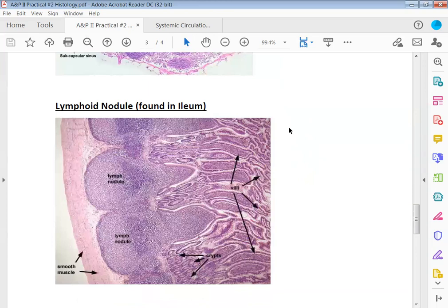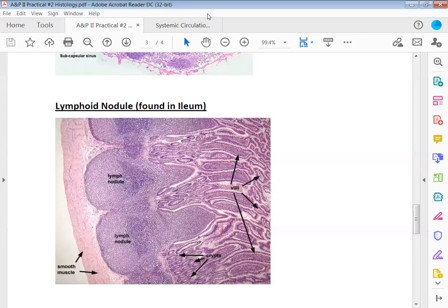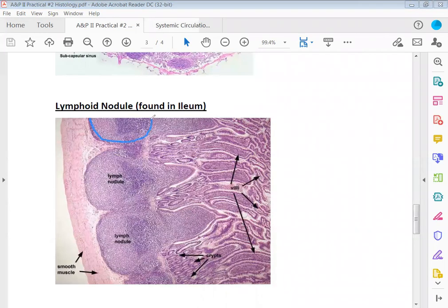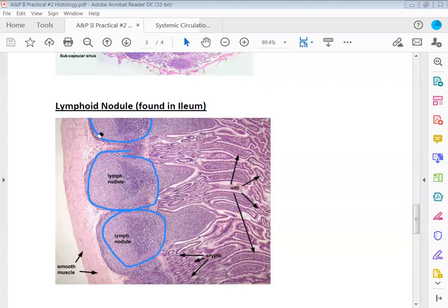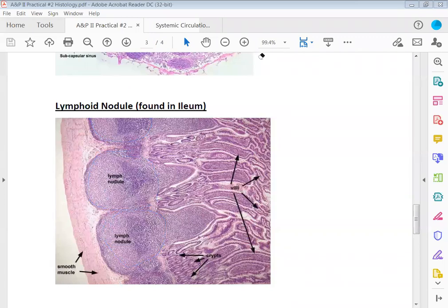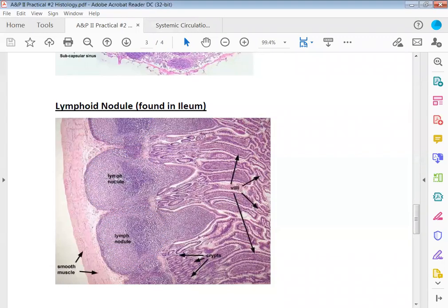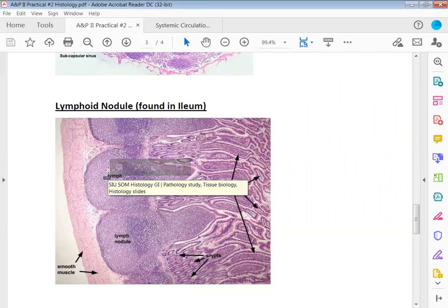Then we have lymphoid nodules. A lymphoid nodule is a localized collection of lymphoid tissues and these are going to be found in a particular area of the small intestines. I'm going to circle each one of these lymphoid nodules. Here you see half of one, here you see one, you see another one. So if I asked you what this structure is here, you would tell me a lymphoid nodule.